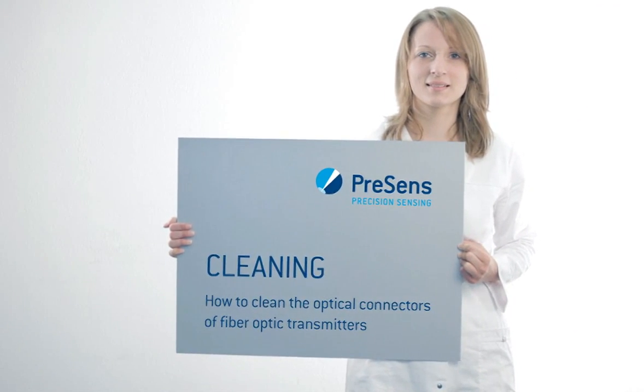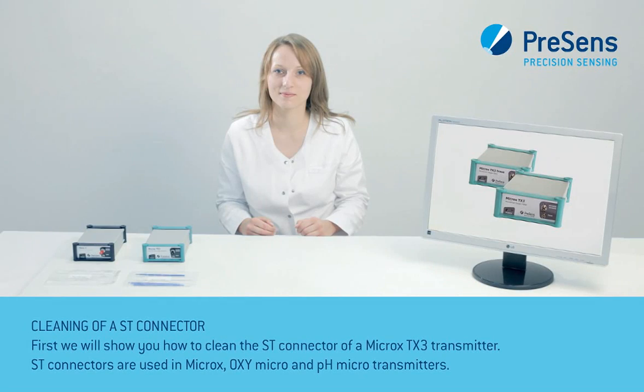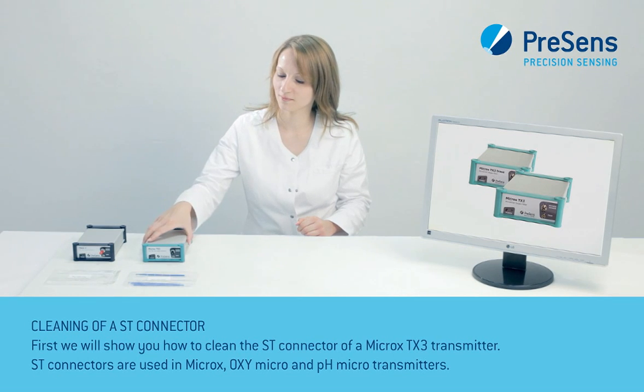Now we will show you how to clean optical connectors of fiber optic transmitters. First we will demonstrate the cleaning of a ST connector in a Microx TX3 transmitter.